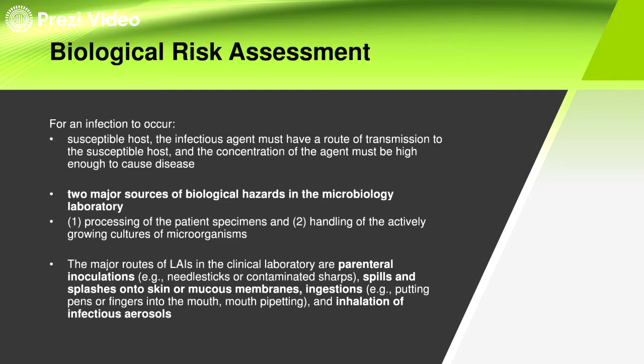Okay? And then another thing is the concentration of the agent. It must be high enough to cause a disease. So, if you are always exposed to that microorganism and then the lab is not practicing biosafety procedure properly, then definitely mataas ang concentration. So, mas mataas din ang chance na magkaroon ka ng sakit.